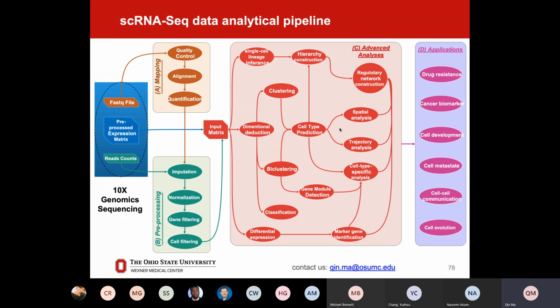Another question: even if I want to do cell clustering like here, to my own knowledge there are about 100 to 200 cell clustering tools and packages in the public domain. So how should I pick the best one from them? And if I have multiple tools, how should I combine them? In a linear way, or in a more advanced way, in parallel?